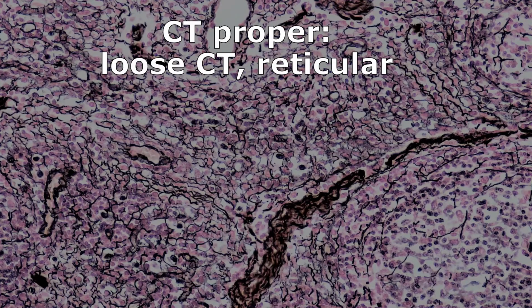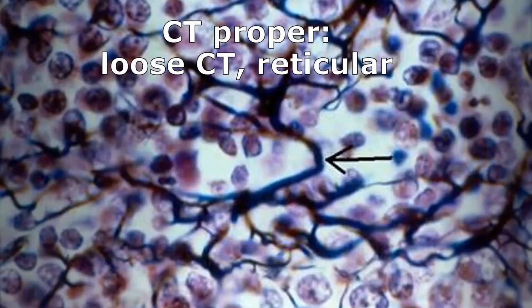This is a more pulled out picture. But if I look at the meat of it, don't look at maybe this big black area here. Let's look just around, and we see, again, black branching fibers. Those are the reticular fibers. And I see here a cherry blossom, a cherry blossom, a cherry blossom. These pinkish cherry blossoms falling from the trees. So function, again, think about lymphocyte activity. So location would be in the lymphatic tissue.